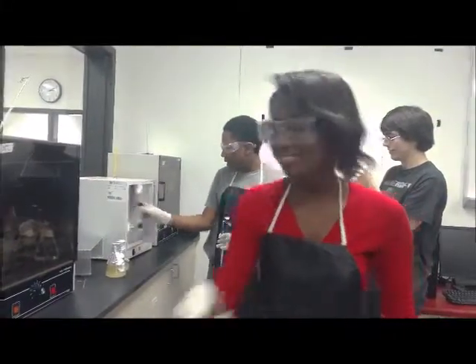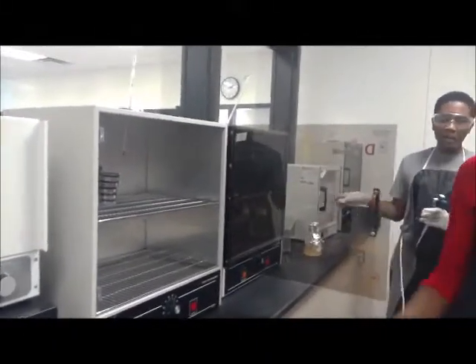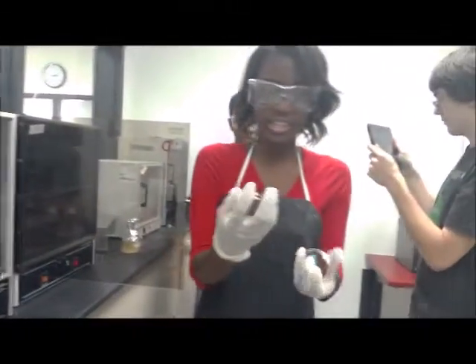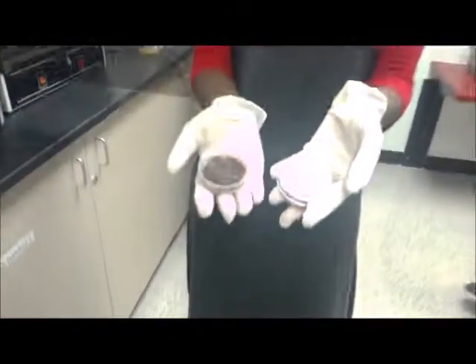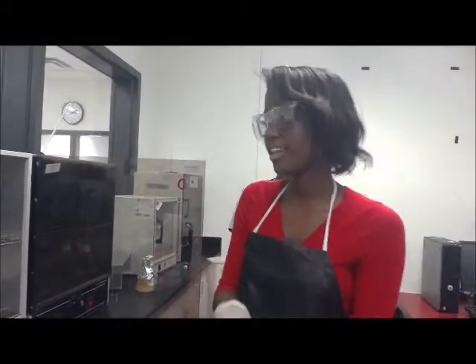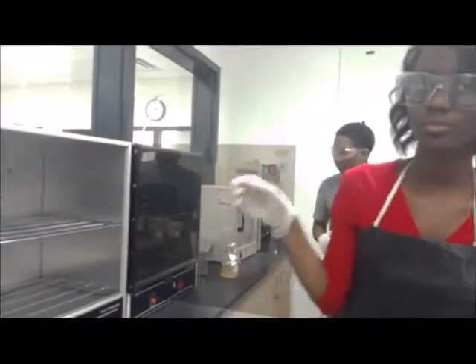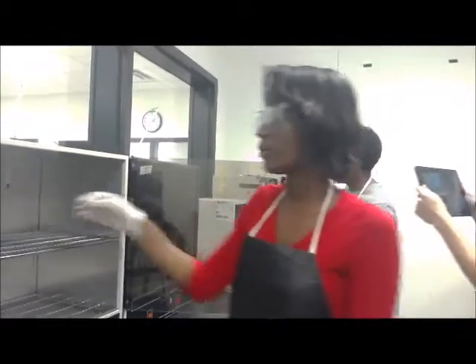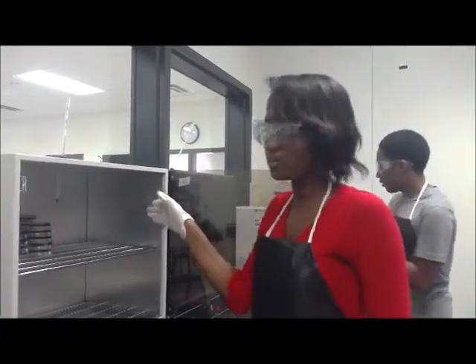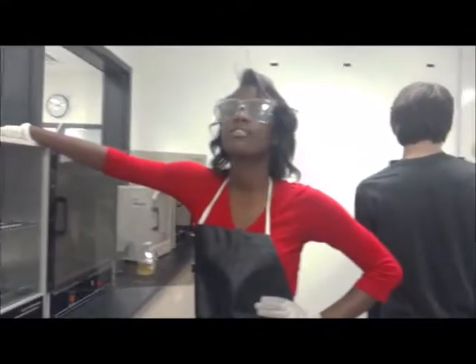Two days later, we come open up the incubator, pull out our petri dishes, and you can see the bacteria has grown. Now we have to wipe it out with ethanol and keep the incubator clean for the next person to use it. That's how you incubate our petri dishes.